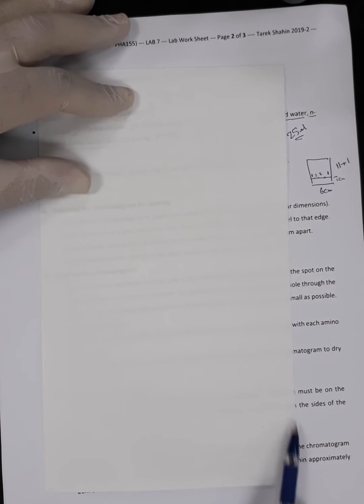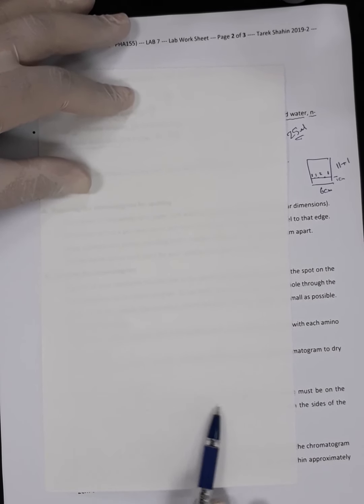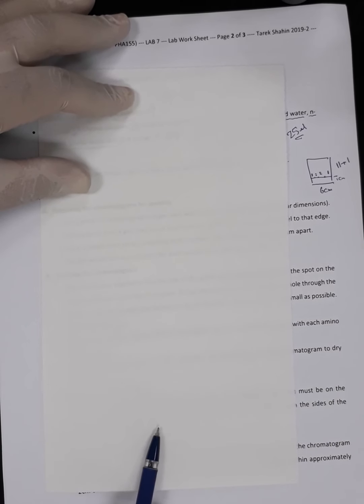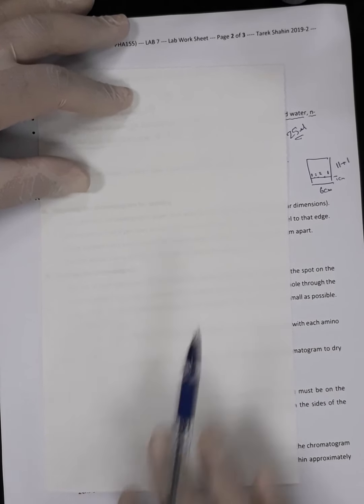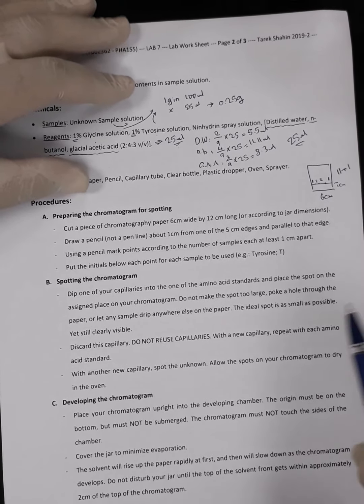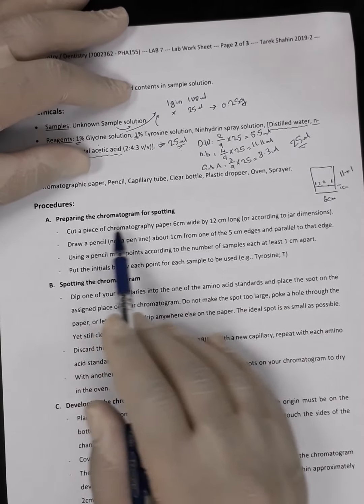Then from this margin to the first spot, I keep 1 centimeter. From the first spot to the second spot, 2 centimeter. From the second spot to the third spot, again 2 centimeter. And then from the third spot to the wall, only 1 centimeter. If you count them, 1 plus 2 plus 2 plus 1 is 6 centimeters. So this is how we prepare the chromatogram.